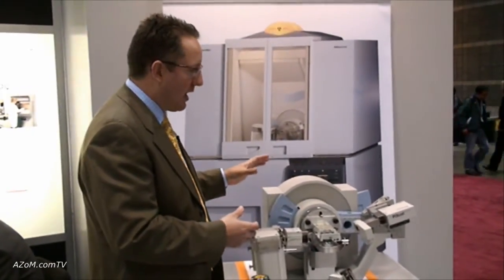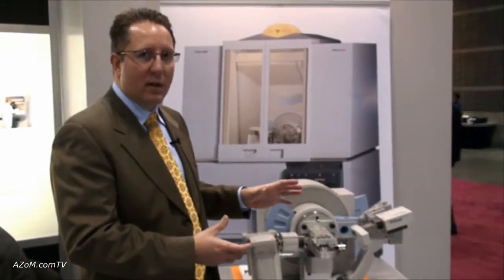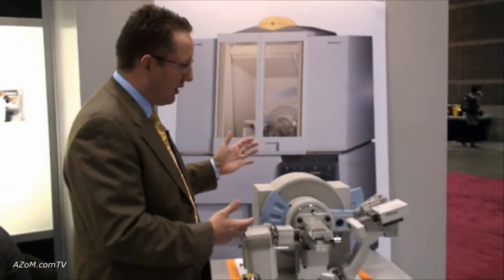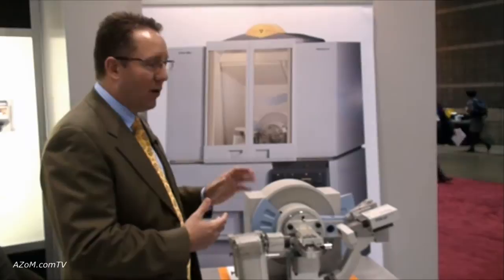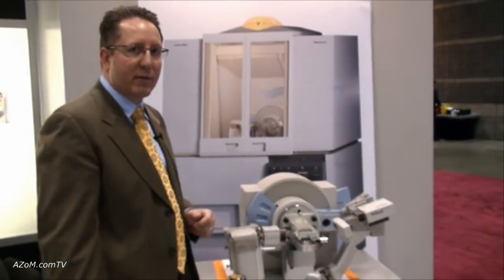The system is designed to be ultimately flexible and for the lifetime of use over a 15-20 year period to grow with you as you go along, giving you ultimate performance over the lifetime of your instrument use. Thank you.